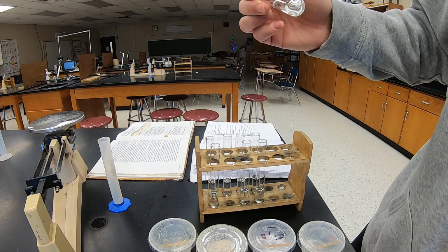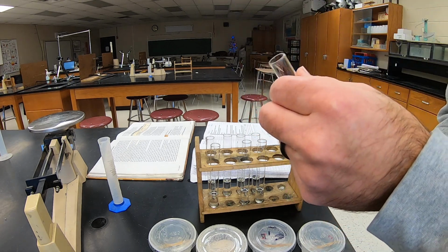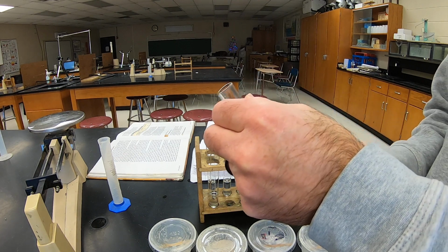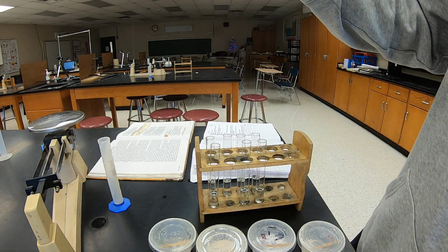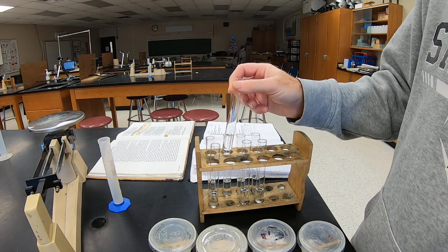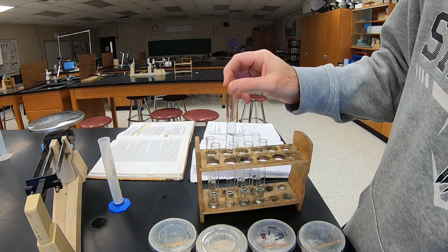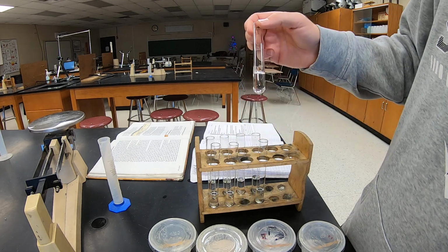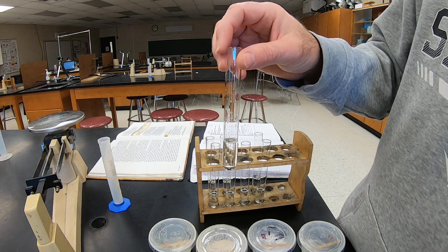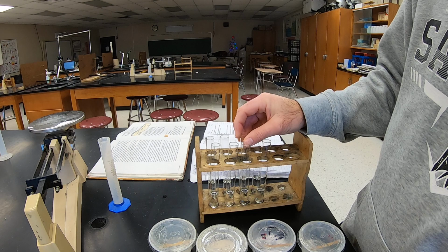The citric acid in rubbing alcohol, there's actually a little bit left in there. Wait a little bit longer. Should be gone now. So the citric acid in rubbing alcohol dissolved. Citric acid and water also dissolved. TOP in rubbing alcohol dissolved. TOP in water, it did not. You can definitely see the TOP floating in the water.